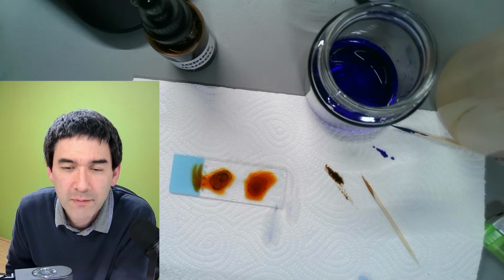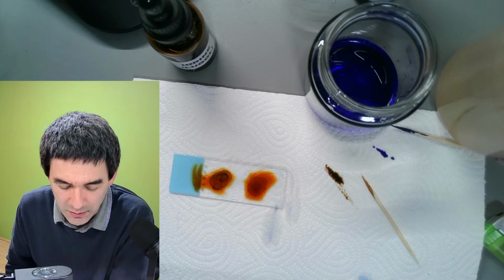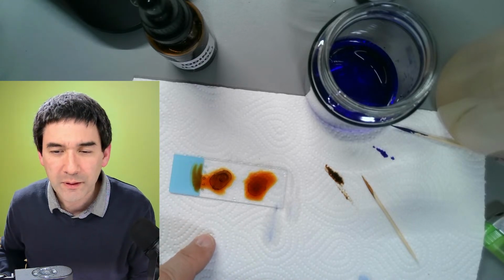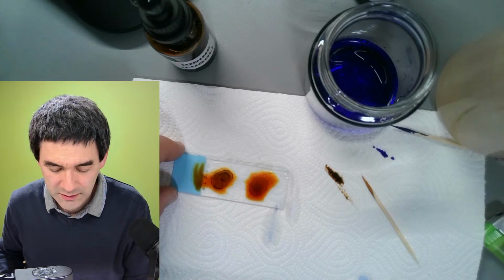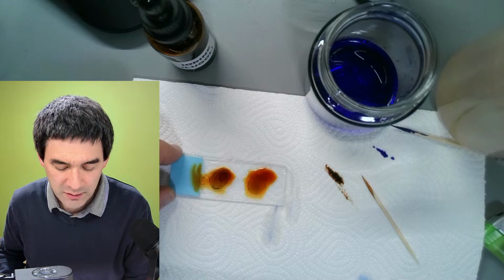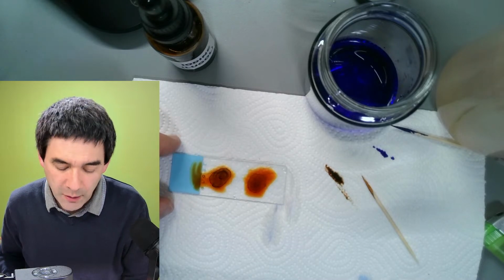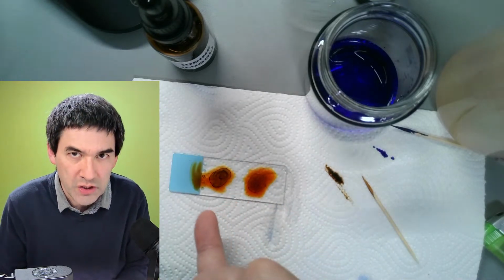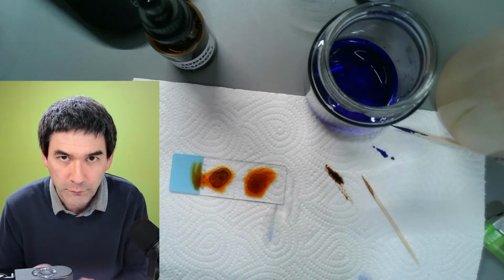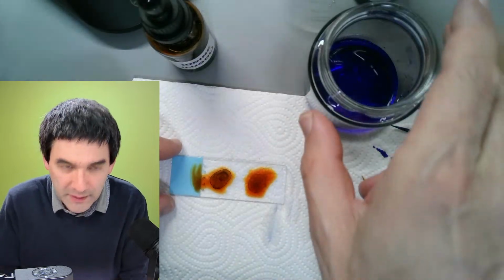Before adding iodine, how does it look? Oh, I think I just showed you. It was just blue. So that's one. This was now the iodine treatment, and the iodine reacted with the crystal violet inside the cells and formed this crystal violet iodine complex.